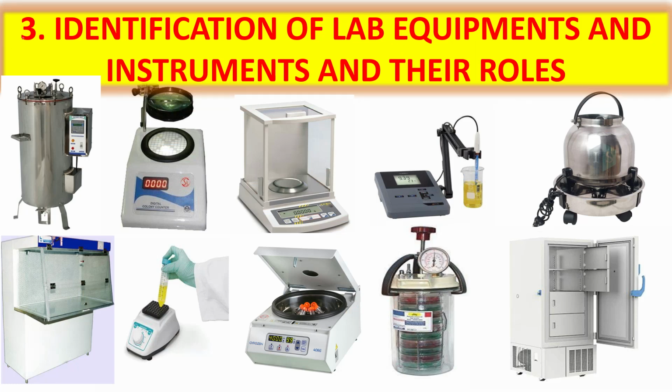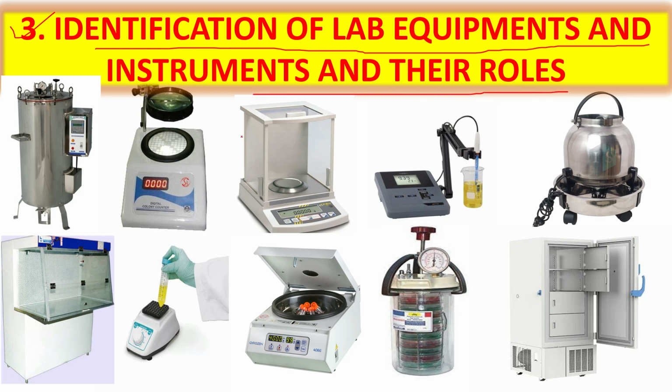The next thing which they can ask you in skill test or practical test is identification of lab equipments and instruments and their roles. So what are the lab instruments or equipments available in a biological lab? You have to identify them and say their roles in the lab. So first thing is the autoclave. So autoclave is used for sterilization, that is the moist heat sterilization, where water and heat are used for sterilization. That is a complete sterilization.